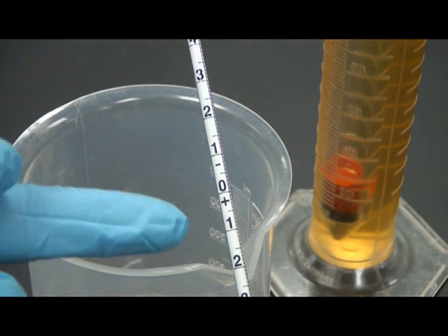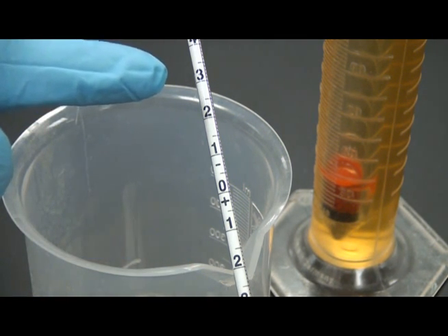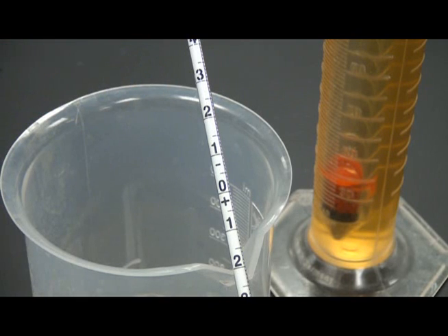Some Brix hydrometers include a plus and minus range. A dry wine sample will finish in the negative portion of this scale.